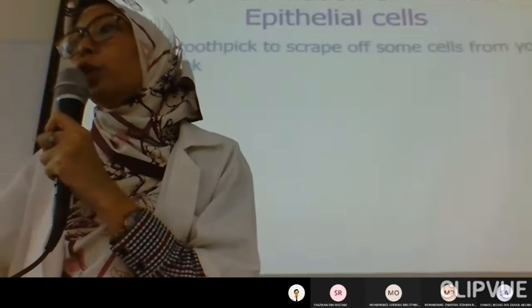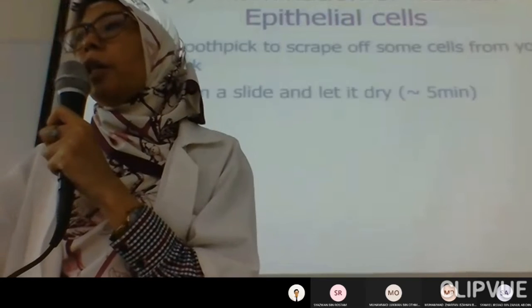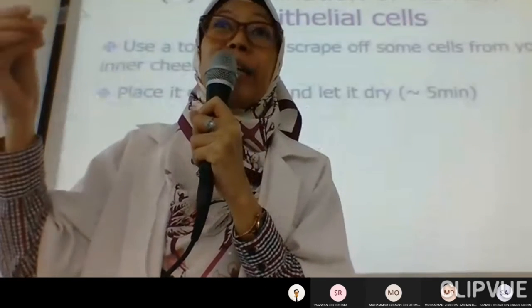Procedures. Use a toothpick to strip off some cells from your inner cheek, then place it on the slide. Of course, you can't see anything on the slide. It's very, very small. So place it.